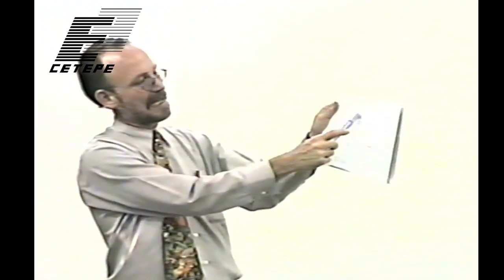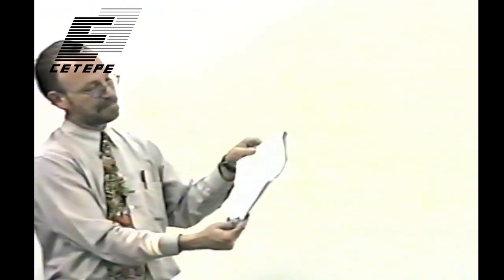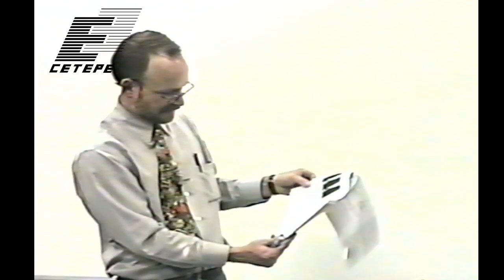Subject unsharpness, he gives a little diagram of it a few pages further on. It's just this concept of, when your subject doesn't line up exactly with the straight lines of the X-ray beam, instead of getting a perfect step function, you're going to get a gradual rise in the signal. So it's a very trivial effect. I mean, it's very intuitive. If you just thought about it, you'd realize that it was there. Then he has a similar diagram for contrast. And we'll be talking a little bit about that.